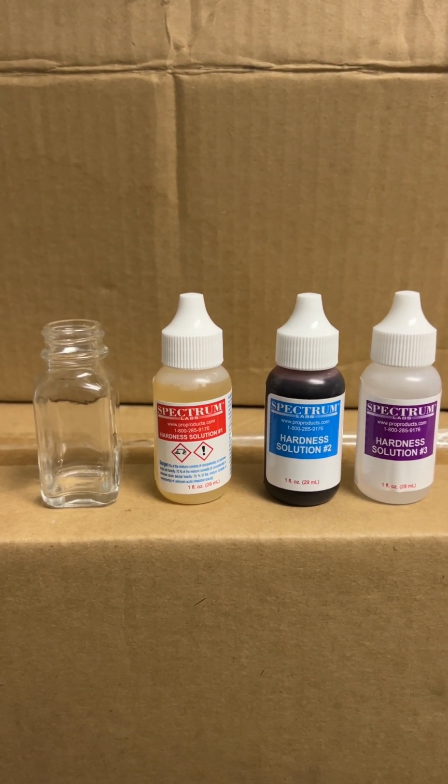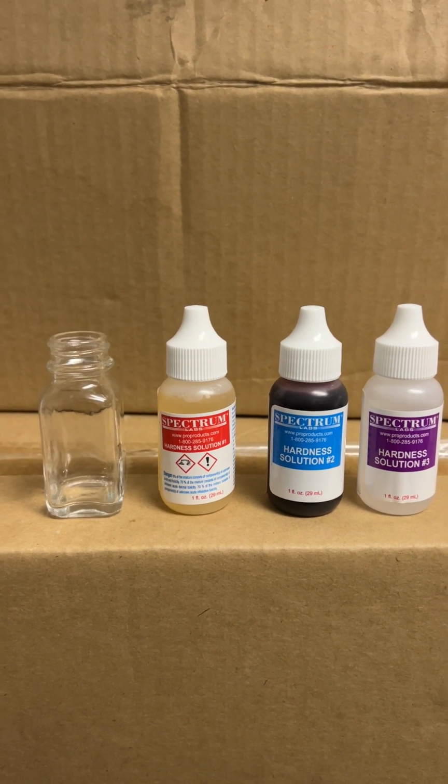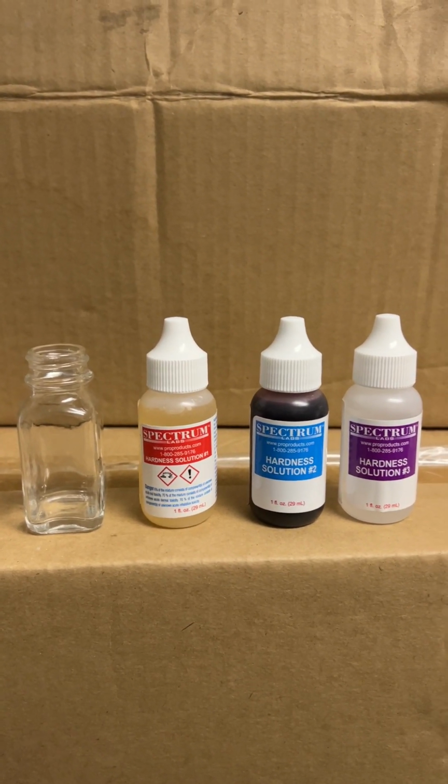This is Kenny the Handyman here, and today I'd like to show you how to test the hardness of your water so that you can properly set the hardness of your water conditioning equipment.